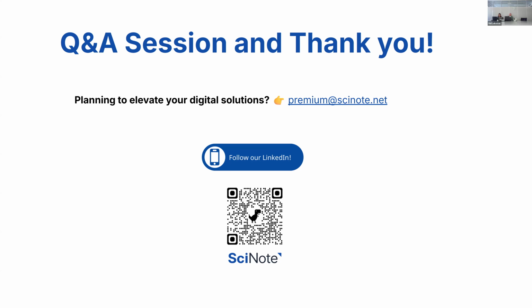Okay, so just a second. Where do I have it? Where is the Q&A session? Okay, there are a lot fewer questions this time than the previous one. No, actually, let me see. Okay, we covered, maybe that was a good webinar, or I hope that's a good sign. Or did we miss any of the questions? I'm just looking at them.